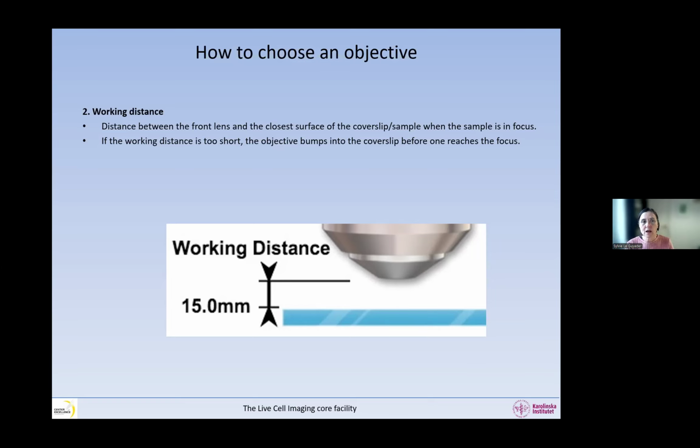For that reason, I really recommend never to clamp your sample, except if you have a reason to clamp it. Because if you end up pushing on the objective, I'm talking now about inverted systems where the objectives are below, and the sample is blocked, you may break the sample, but you will also damage the objective. So don't clamp your sample when you have an inverted system. And when you're upright, be very careful, because then you can just crash.